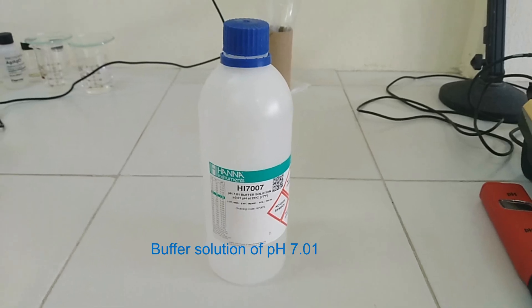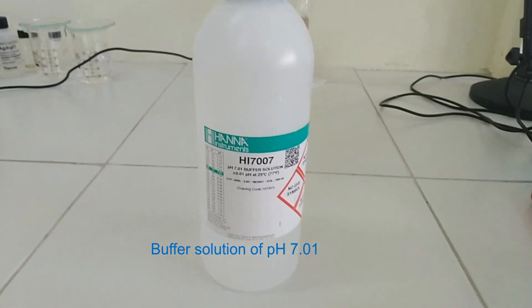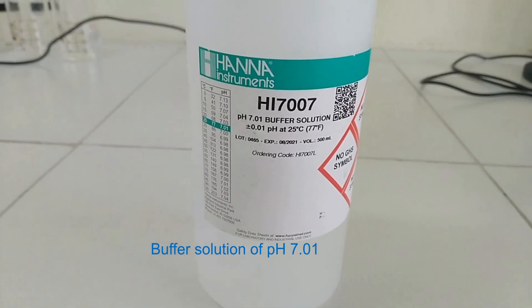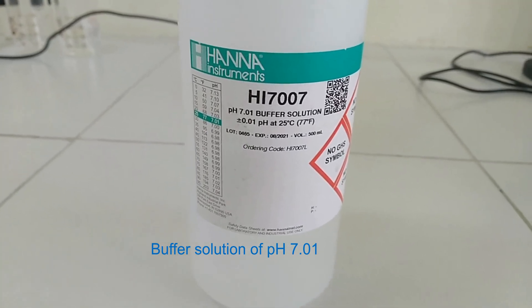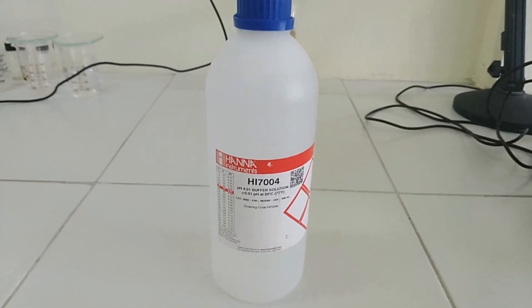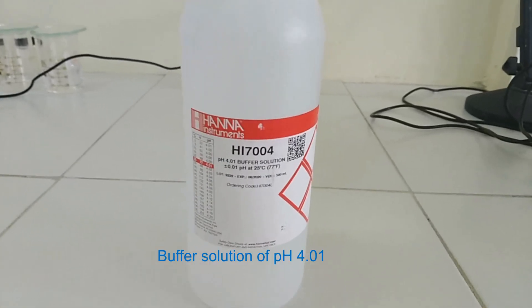Buffer solution of pH 7.01 and 4.01 is sufficient for two-point calibration of any type of pH meter or general buffer. Always start calibration with buffer solution of pH 7.01 first and then with 4.01.